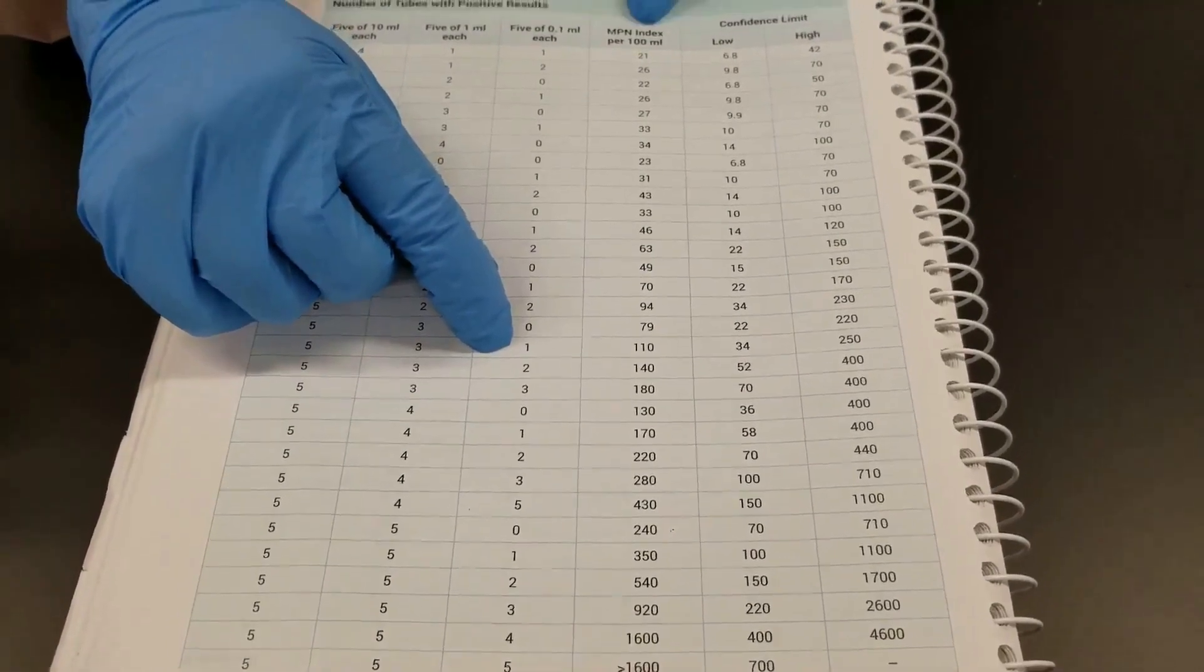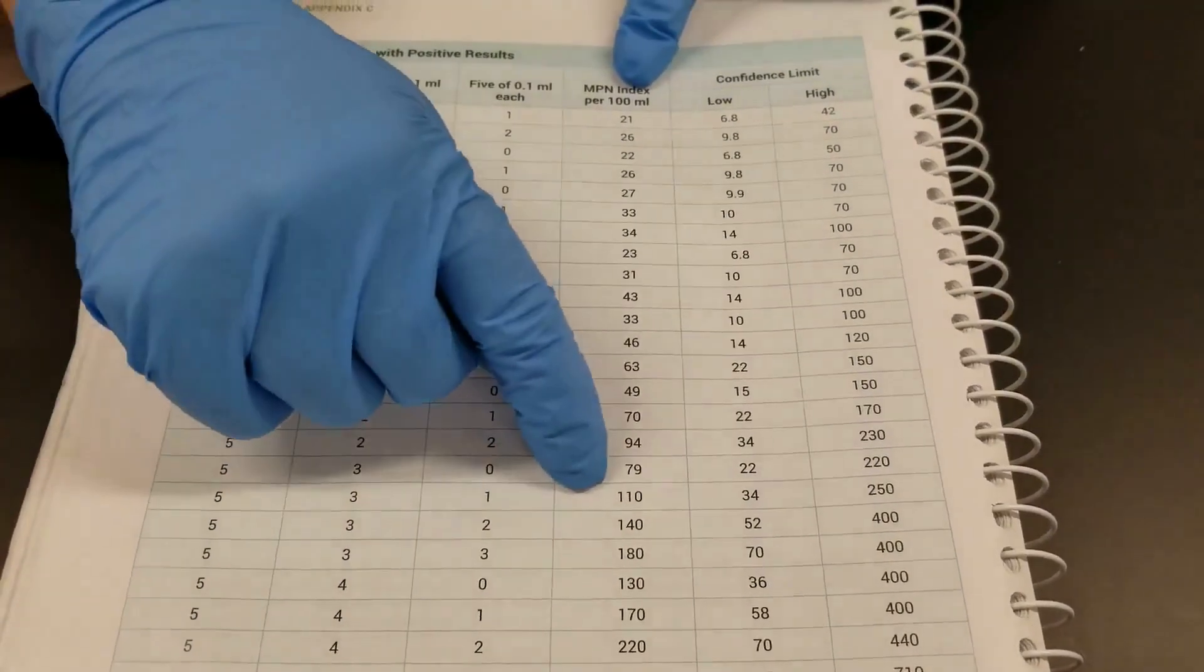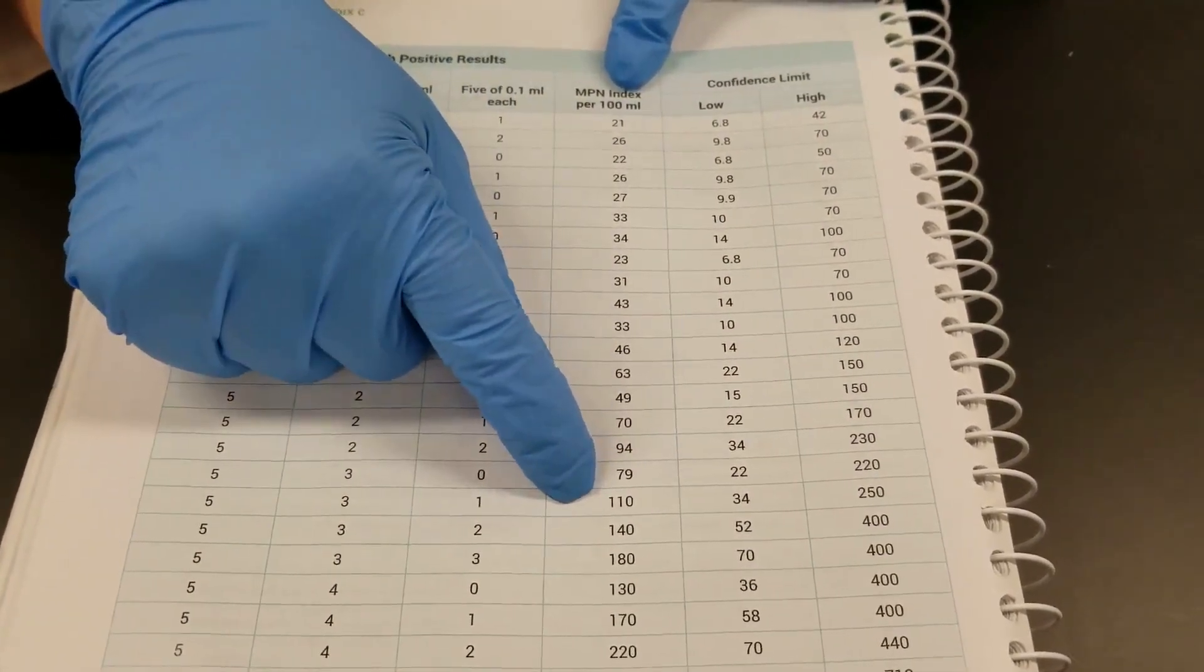And then this next column is the most probable number index per hundred mils. So, what does this number right here tell you? One hundred ten.